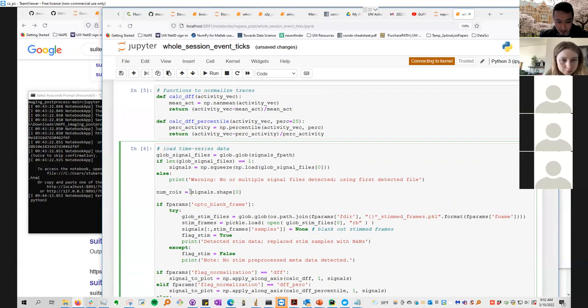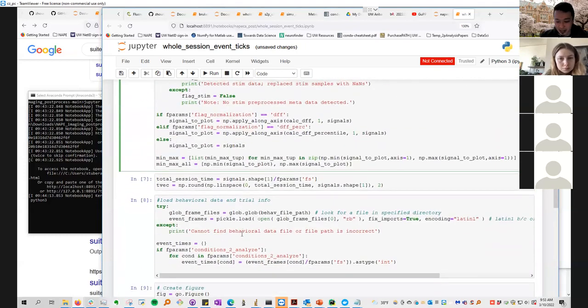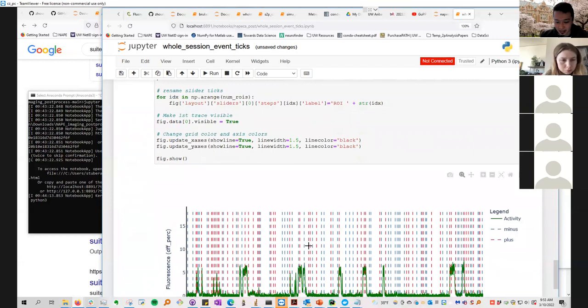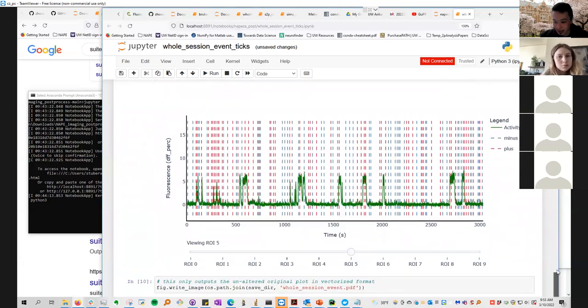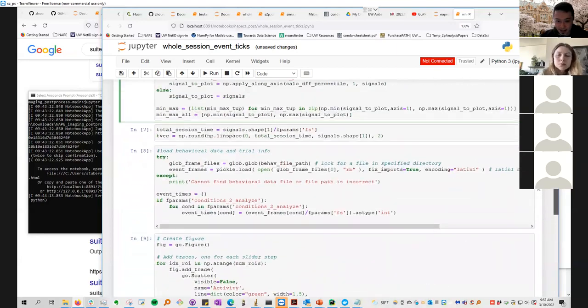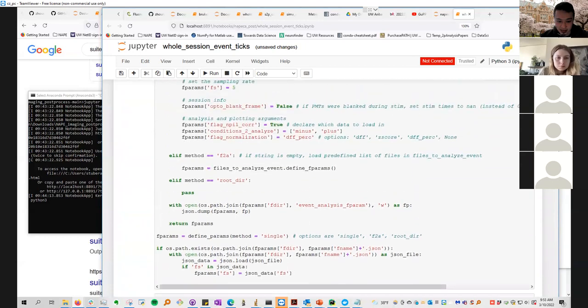You can delete this 10 and the hashtag, and then if you execute this all the way through, it'll show all the cells. And see down here, it'll go through the total number of cells. I just use 10 because it's a little bit faster to execute for now.